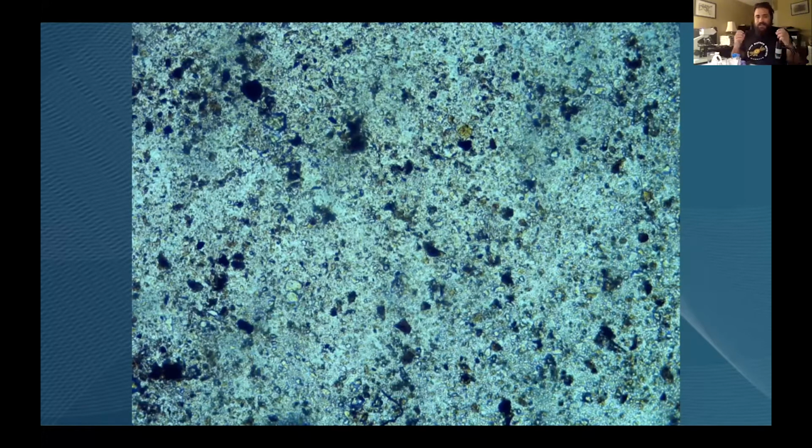So what's really interesting is that there's all this compaction. There's a video we'll play later, and you'll see that this is all bacterially dominant, reminiscent of the initial disturbance event, where the bacteria are the ones that are able to solubilize the nutrients out of the parent material, these lithotrophs, and then whatever organic material is left over from decomposing microbial bodies, higher organisms like ciliates are basically breaking this down in general. So this is an example of dirt.